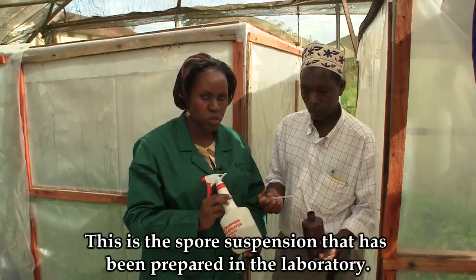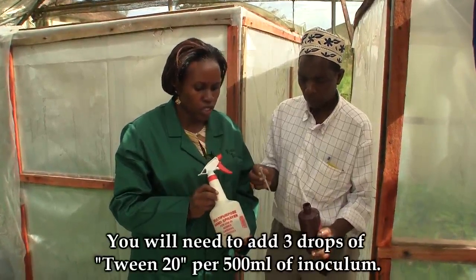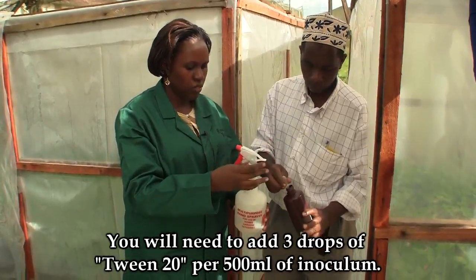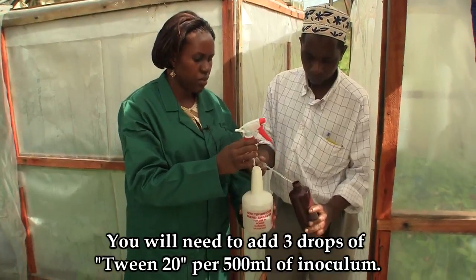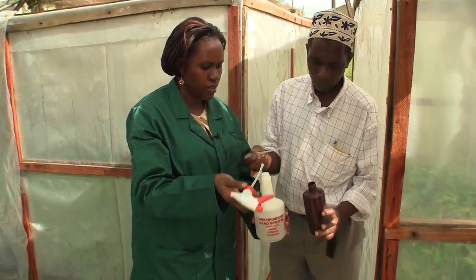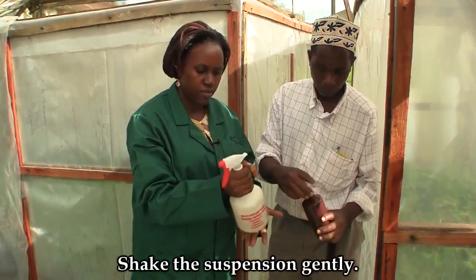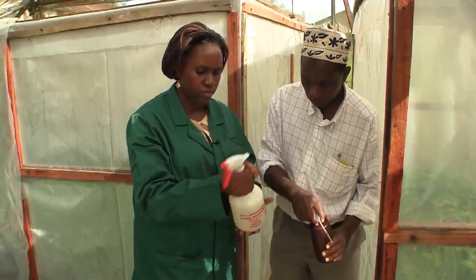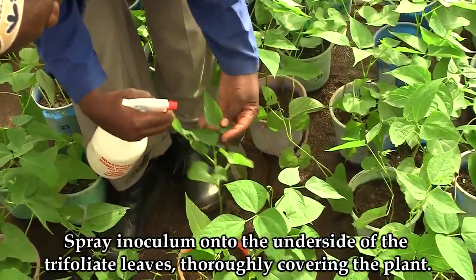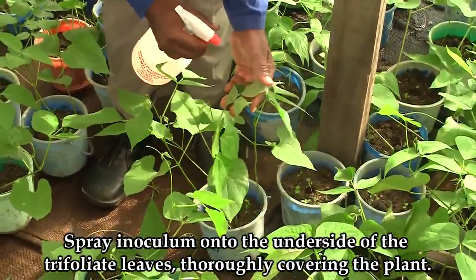This is the spore suspension that has been prepared in the laboratory. To inoculate, you will need to add Tween 20. To 500 millilitres of the inoculum, add three drops of Tween 20 and shake. Spray the inoculum on the bottom side of the trifoliate leaves, thoroughly covering the plant.